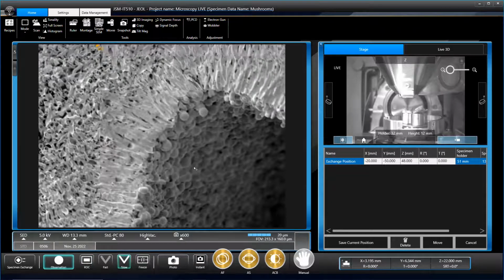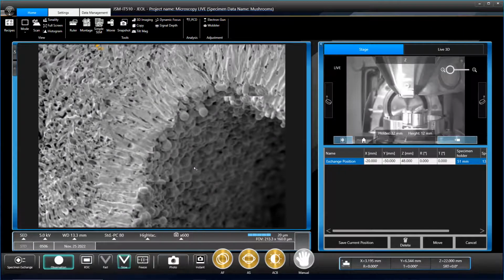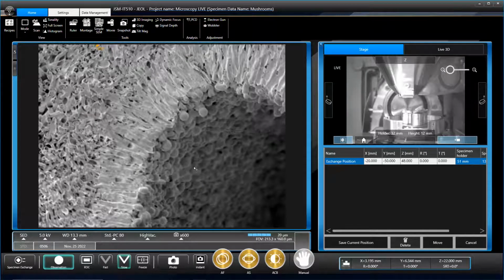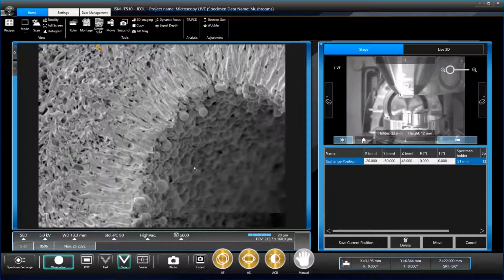Back into the slow one, should hopefully get quite a dramatic picture. I say that with my lack of focusing skills on a 3D sample. It's cool how you can see the spores. That is impressive, isn't it? It must be because it's a protected thing. Just hit the photo button on there. We'll save that photo of that one.